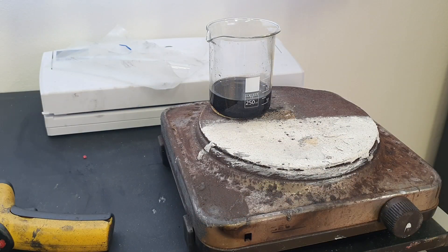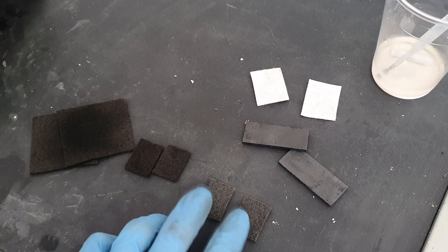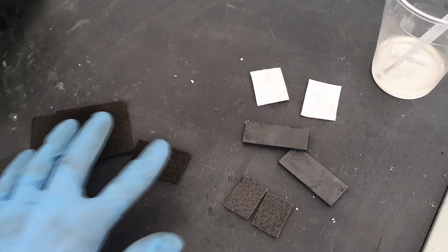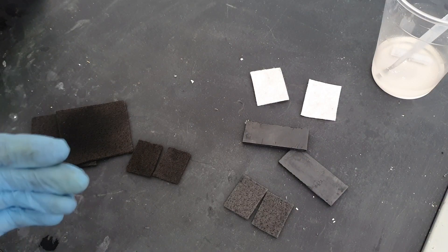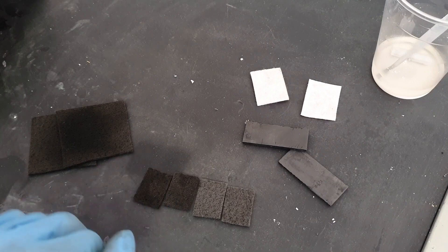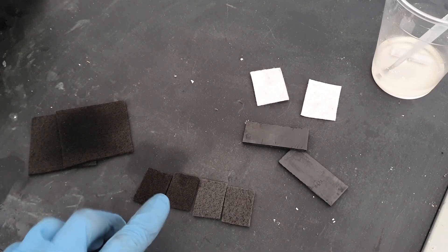So the carbon fibers are in this acid for 1 hour and now I will wash the carbon fibers and dry them. Here I have two carbon fibers which I did not put in the acid, and here are the carbon fibers which I put in sulfuric acid and nitric acid, 3 to 1, at a temperature of 60 degrees C for 1 hour. You can see some color change — these carbon fibers are a little bit darker.